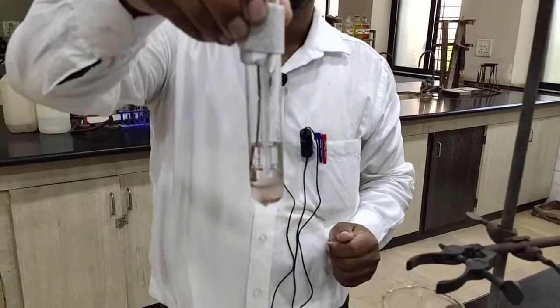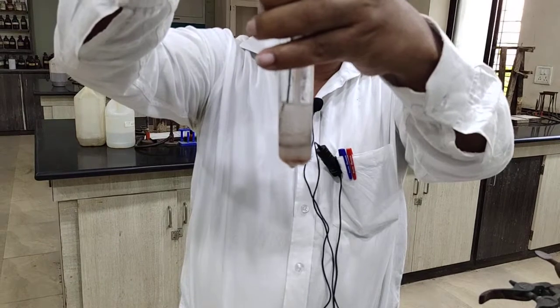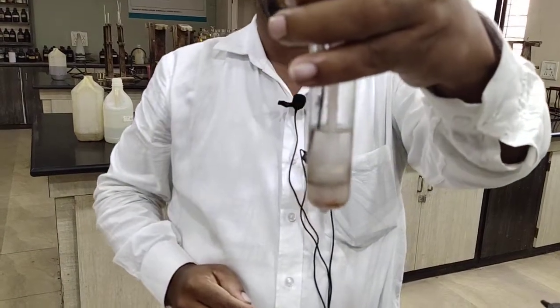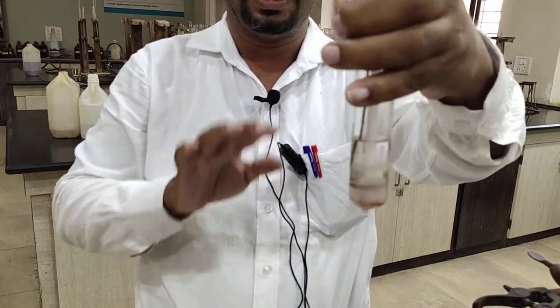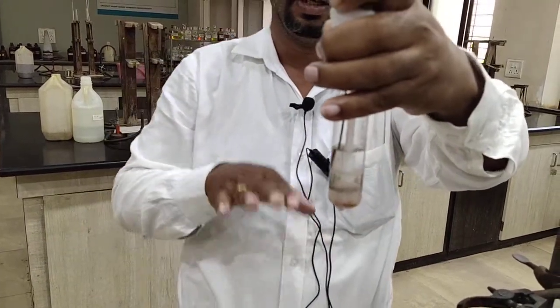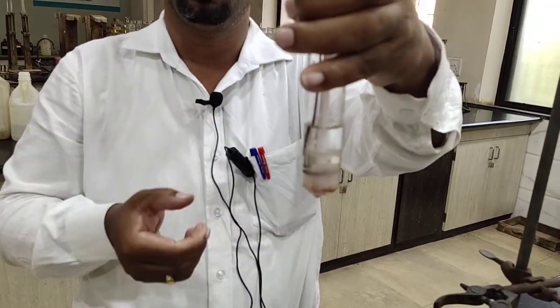We know these two layers become miscible in each other as we increase the temperature. So this is temperature dependent, and the mixing temperature depends on the composition of the two components.